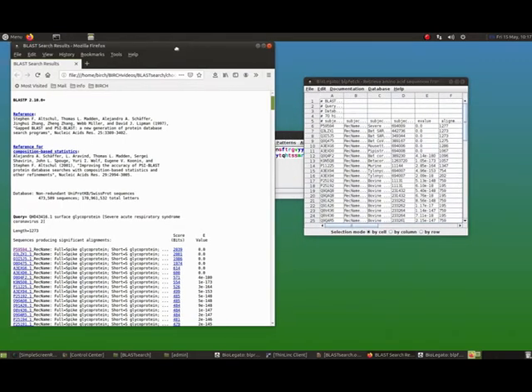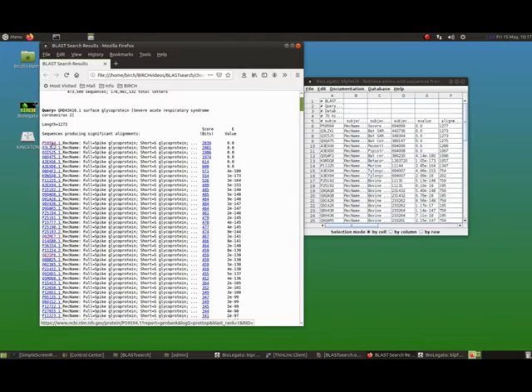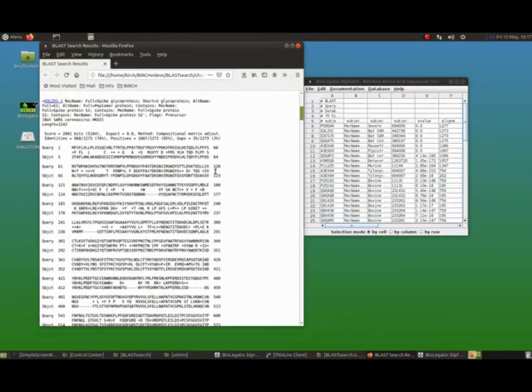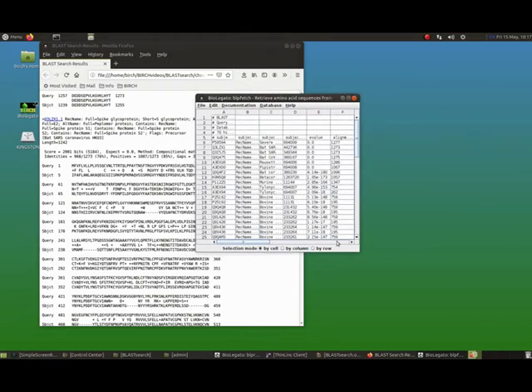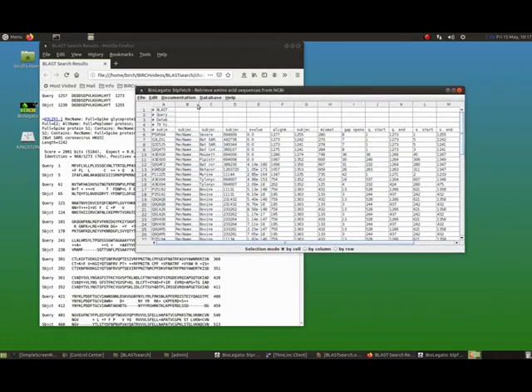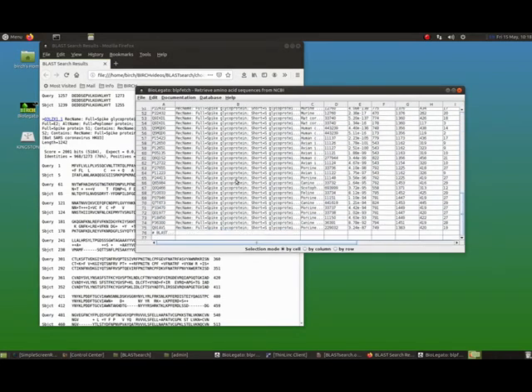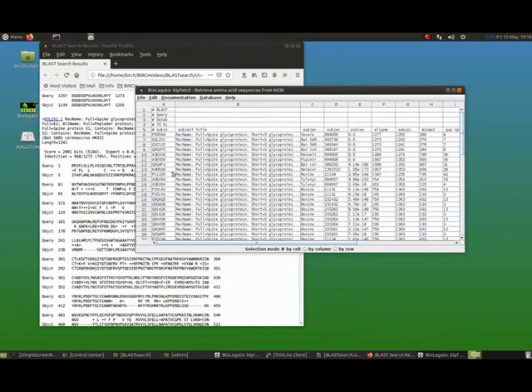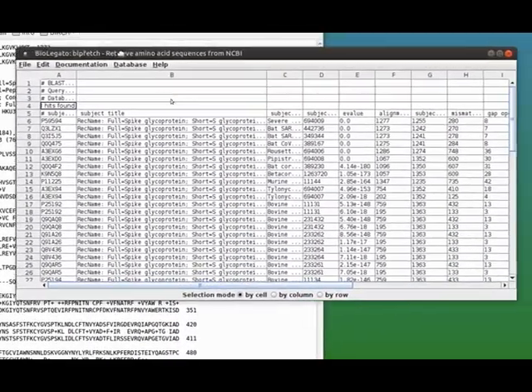So just taking a quick look at the output in the report, of course for every hit you've got a link to the sequence and then a link to the alignment that's shown here. So we get all of that information, and then we get much of the same information in the NCBI report. So we can see here the subject title. Each hit is the subject sequence. There are a total of 70 hits that were found, and maybe I should just zoom in on this to make it a little easier to see what we're doing.